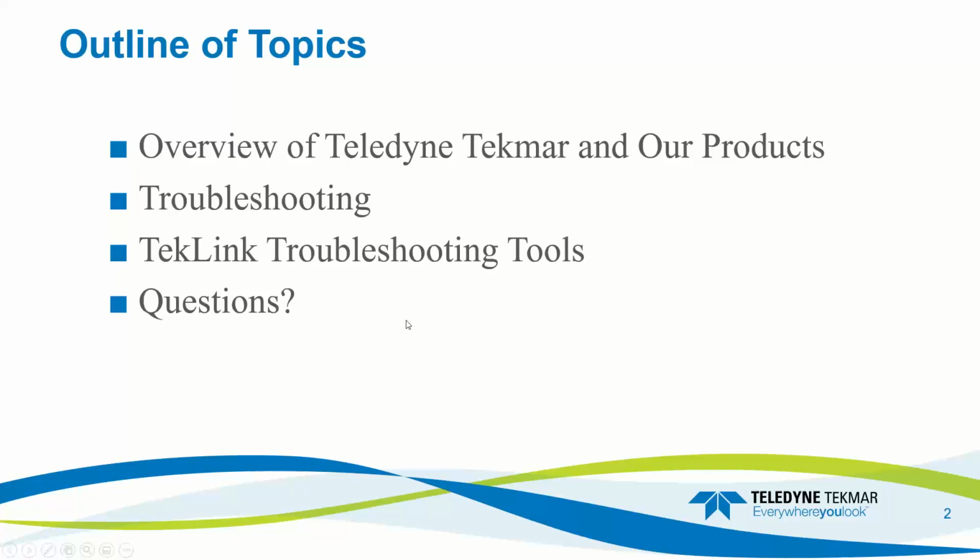I'll go over a quick little introduction to Teledyne Tekmar and our products. I will give the troubleshooting tips on a couple of different topics. And I'll show you some tools that you can use, if you have a Tekmar product, that can aid in the troubleshooting process of a Purge and Trap. And be sure to submit any questions you have, and I'll be able to answer you by email.